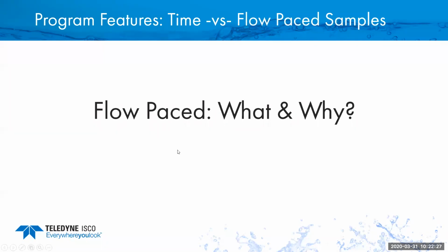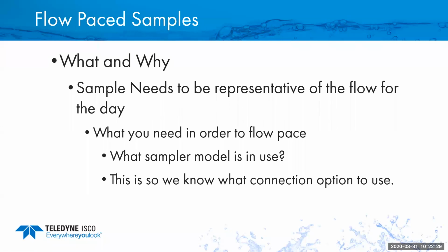Flow pacing samples. If you're flow pacing a sampler, the sample that you collect in the end needs to be representative of the actual flow for that day. So it has to be basically a representation of your flow for the whole day. This gets a little bit more complicated when you're trying to set up a flow paced sampling system.